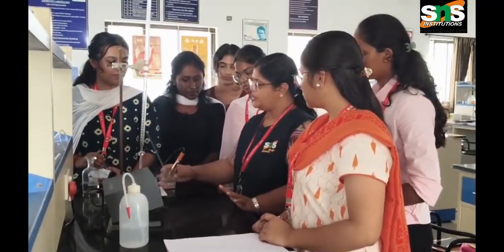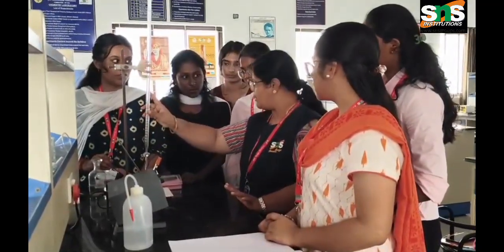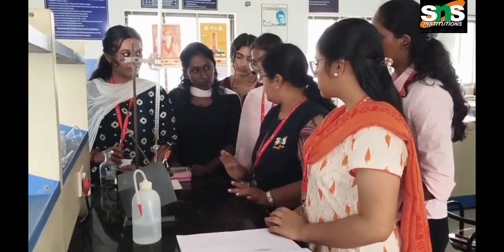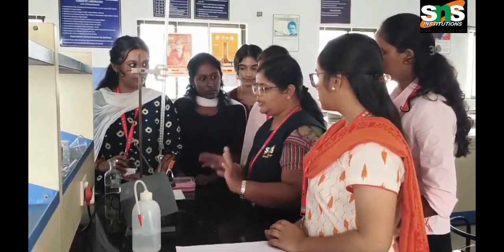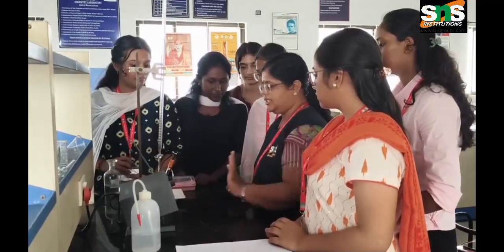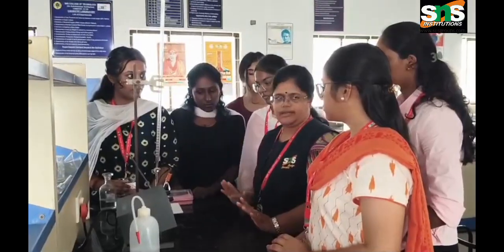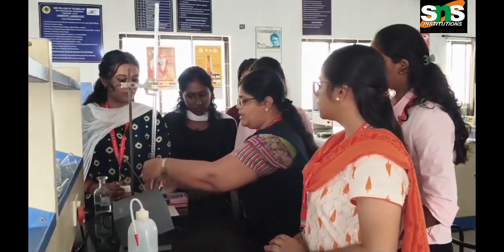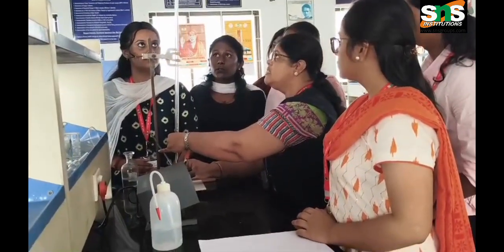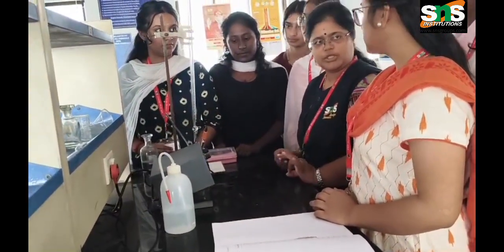This is sodium hydroxide, a strong base. Now we are going to titrate the acid mixture with this strong base. I have set the temperature, the conductance cell constant and the range, everything in this apparatus. Now we are going to titrate. I will add 1 ml of the base into the solution.